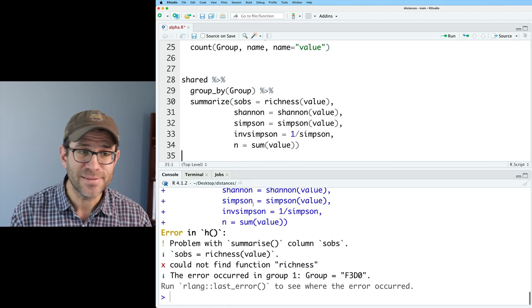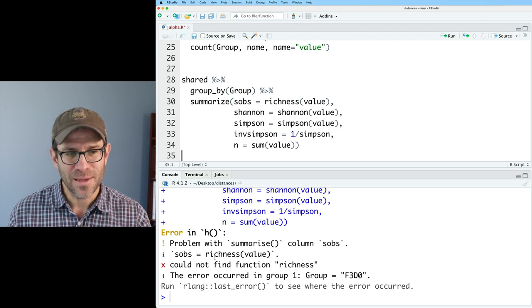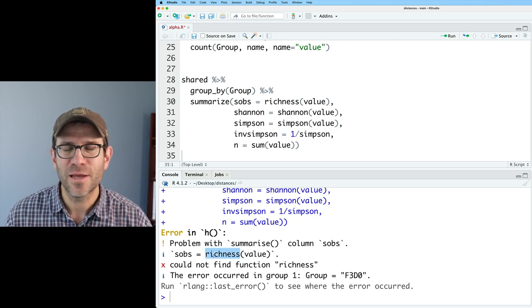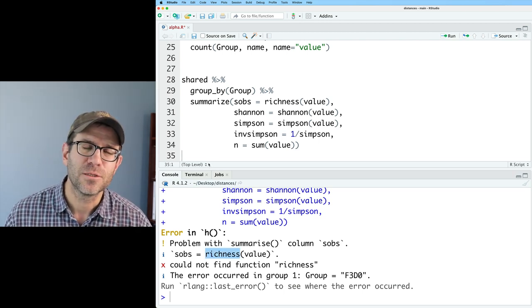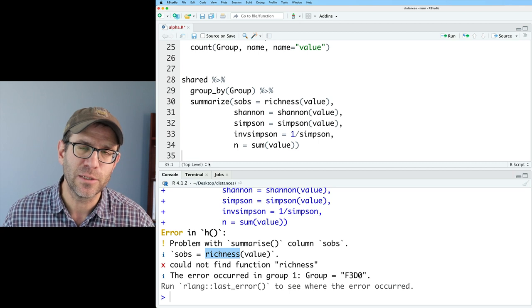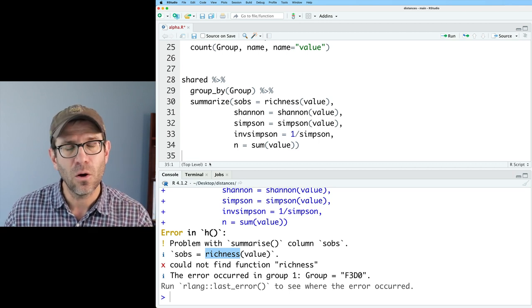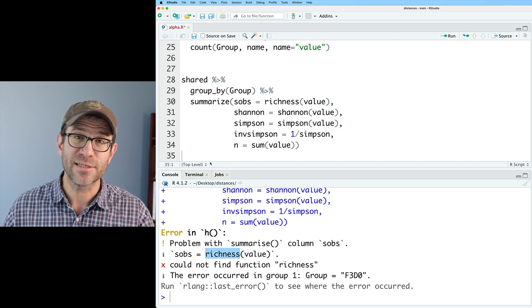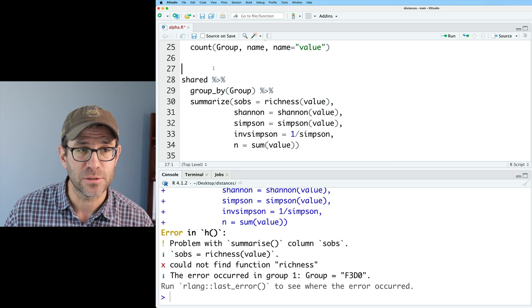If I run this, it complains because there is no richness function. In a bit, I'll show you how we can get richness out of vegan. But for now, I want us to practice our skills writing our own functions.